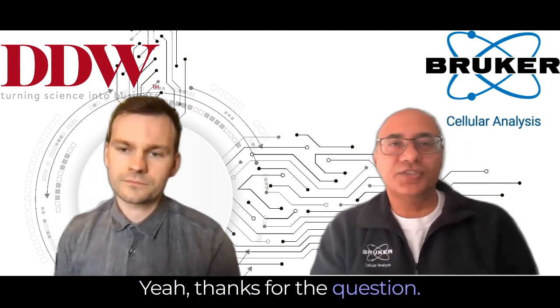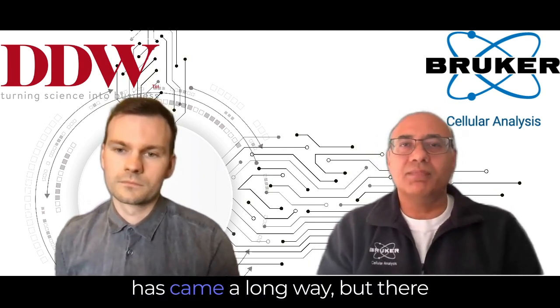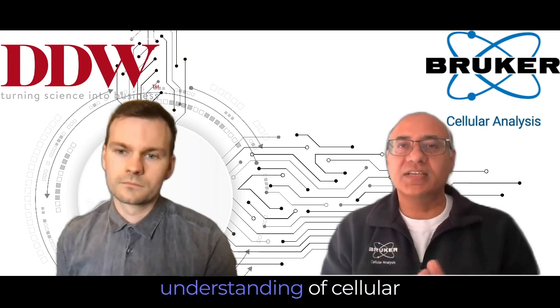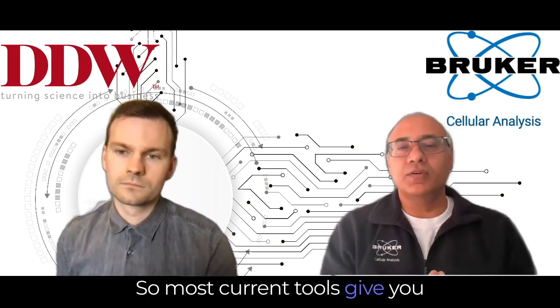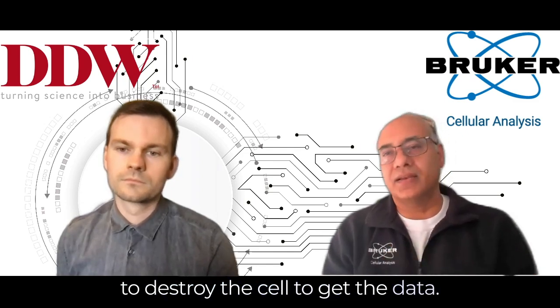Yeah, thanks for the question. Single-cell research has come a long way, but there are still major gaps, especially when it comes to comprehensive understanding of cellular function in a more dynamic way. Most current tools give you only a snapshot or force you to destroy the cell to get the data.